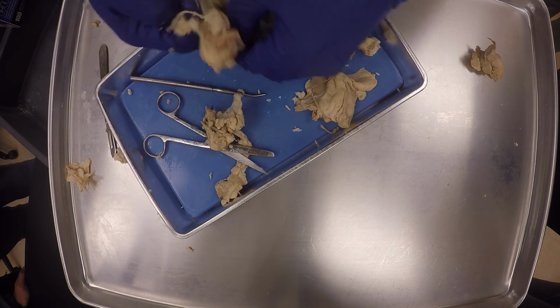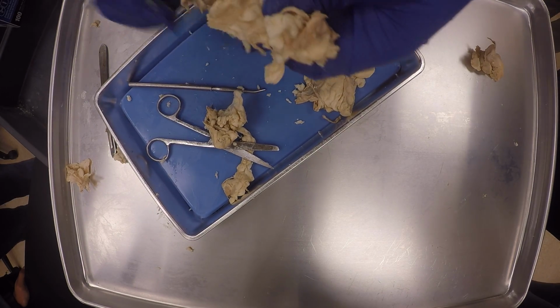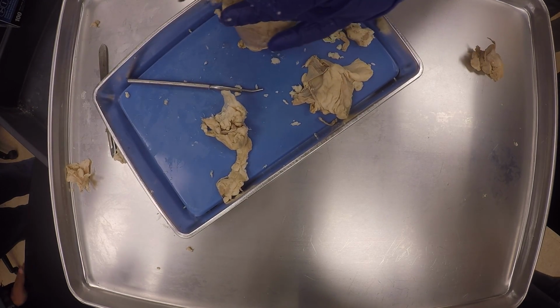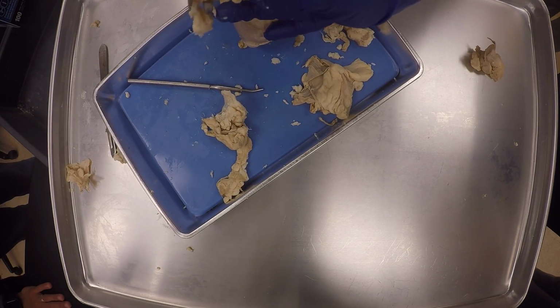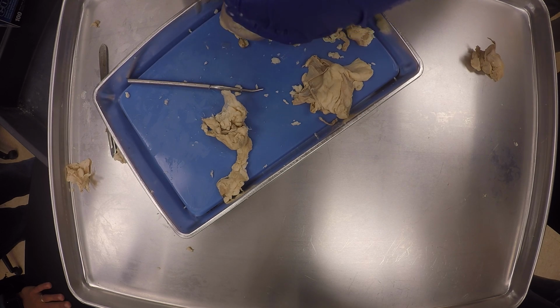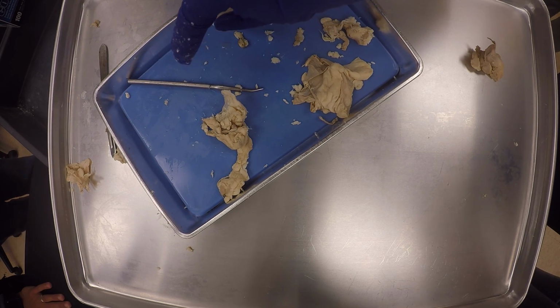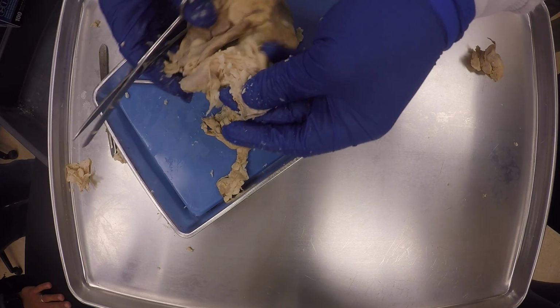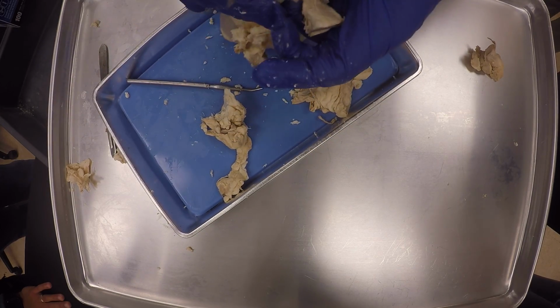Probably this is the brachiocephalic trunk. It's going to look a little messy for now. You see what I'm saying? The brachiocephalic trunk and then the aortic arch.